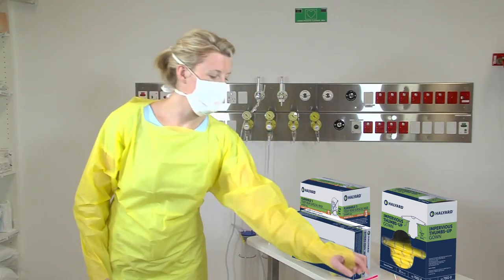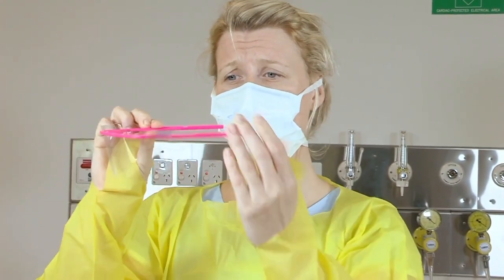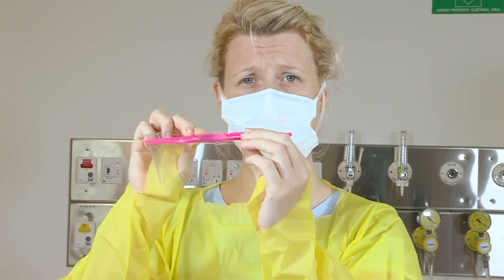The next item that we don is appropriate eyewear — so either using goggles or a full face shield. Apply appropriately, touching only the sides and not the front, so you don't contaminate.